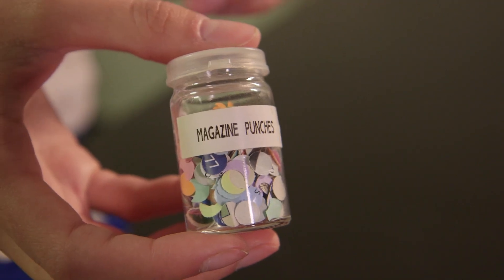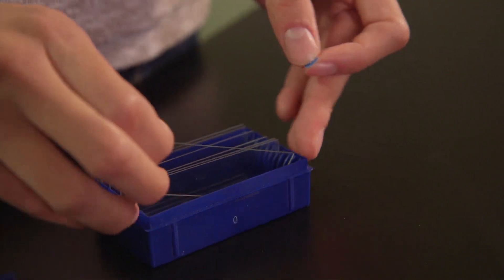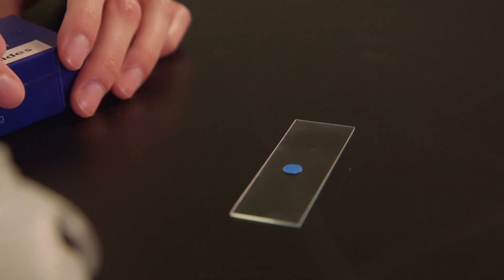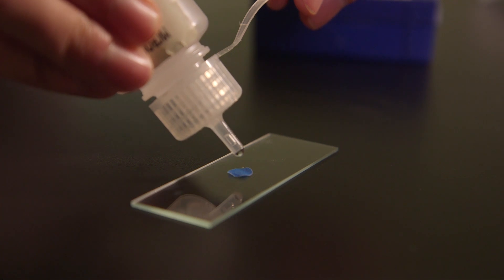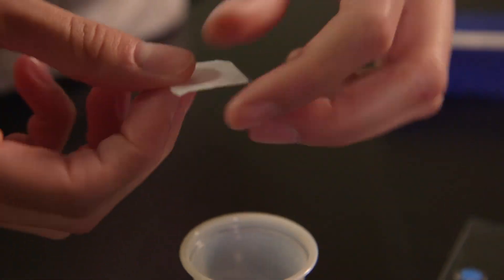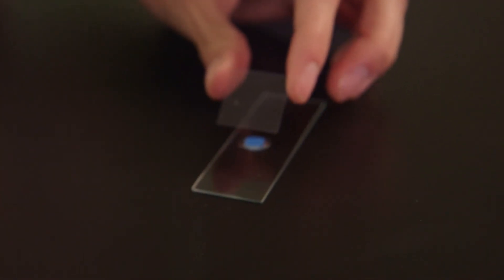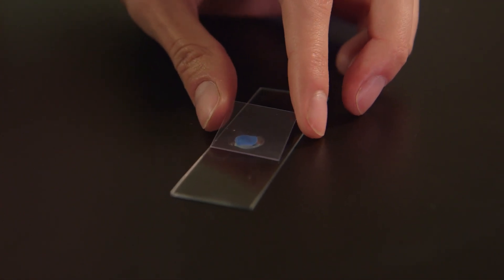Now we will make a wet mount or temporary specimen of a magazine punch. Grab a clean plain glass slide from the blue box in your tray. Place a magazine punch on the slide with the colored side up. To prepare a wet mount, the specimen must be placed in some type of liquid, usually water. Place one drop of water on top of the magazine punch using the dropping bottle provided. Obtain a clear plastic cover slip from your tray. Handle the cover slip by the edges to avoid fingerprints. Place one edge of the cover slip in the drop of water and lower the cover slip on the slide at an angle to prevent air bubbles.